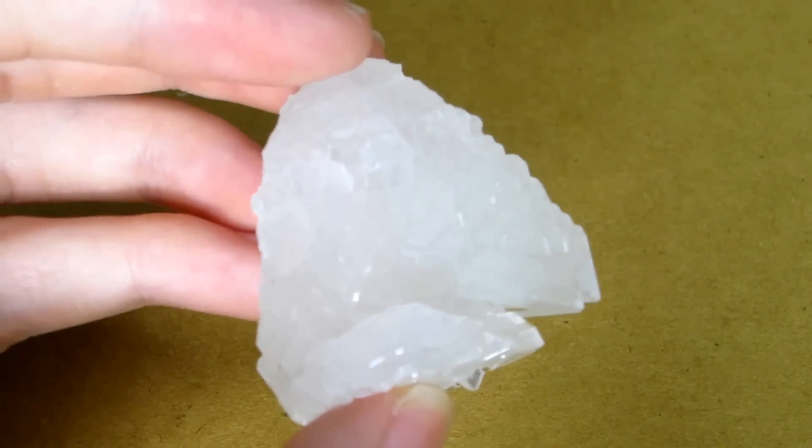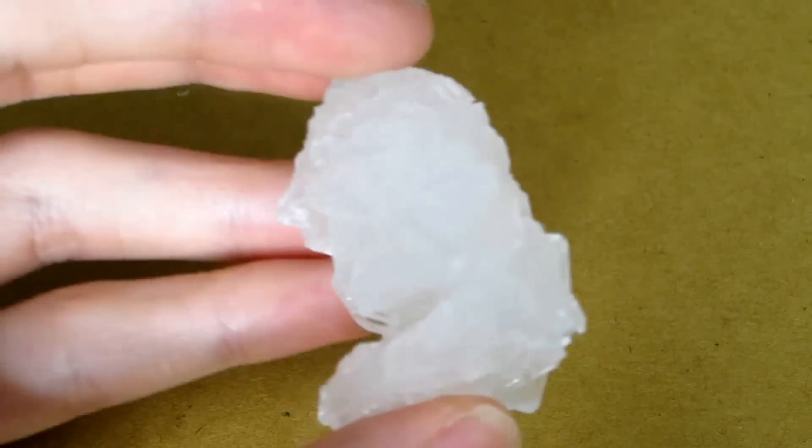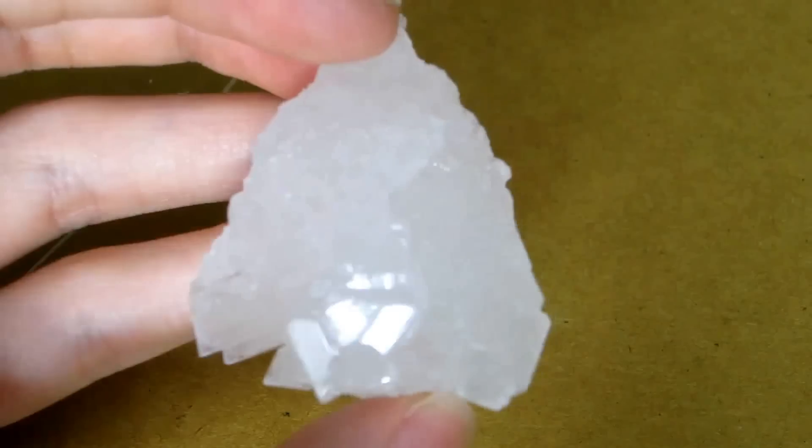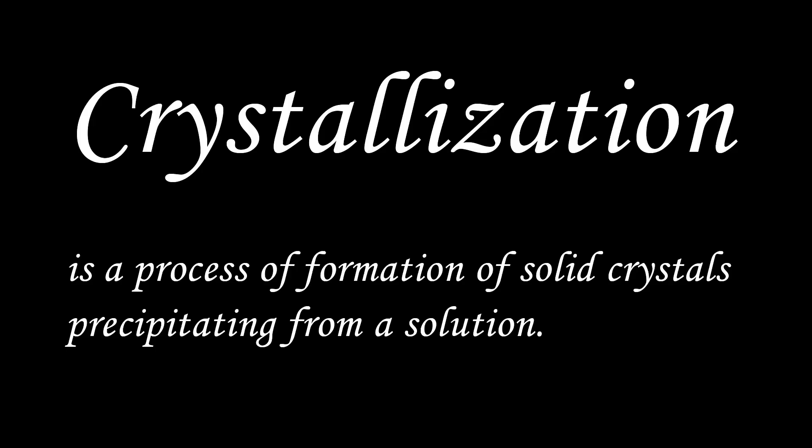Today we are going to grow alum crystal, but the following steps are almost the same as growing copper sulfate crystal. Crystallization is a process of formation of solid crystals precipitating from a solution.